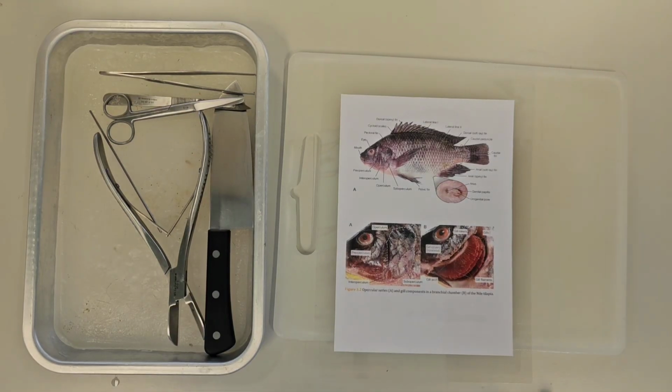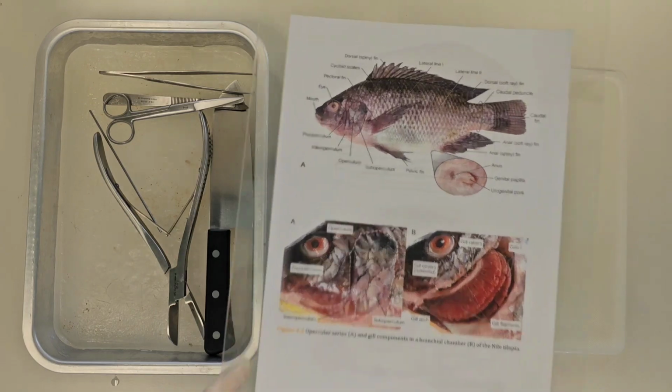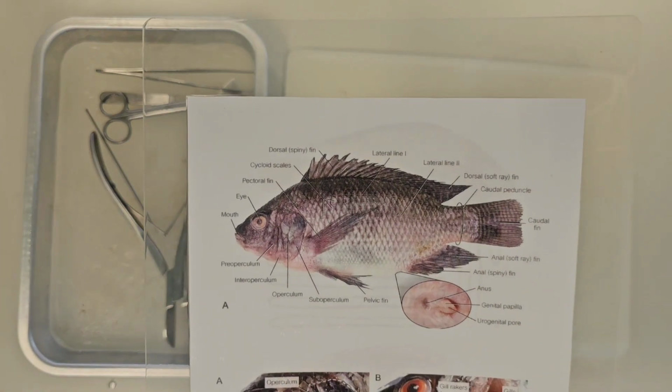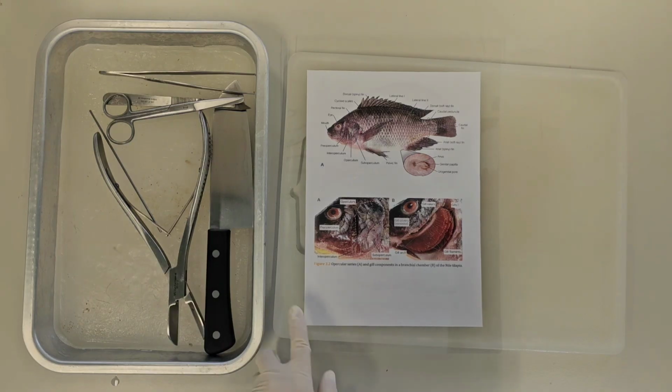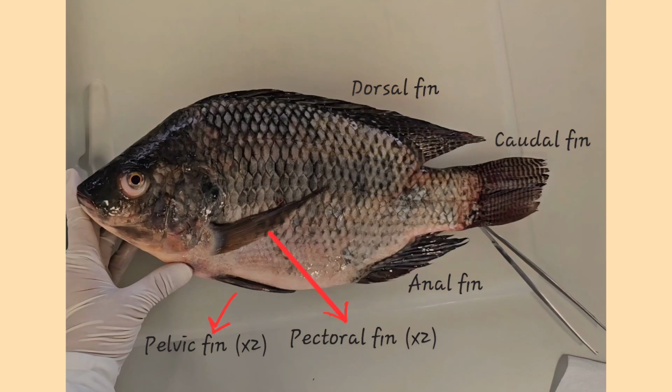Hello everyone. Today we're going to do the fish dissection. Our sample today is the Nile tilapia. Let's see the surface anatomy first.